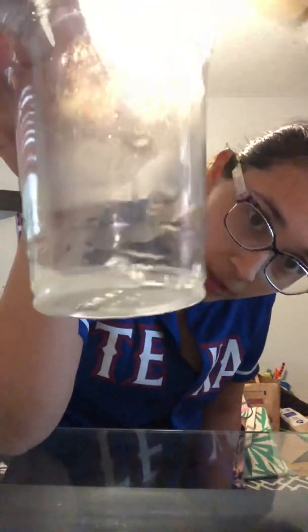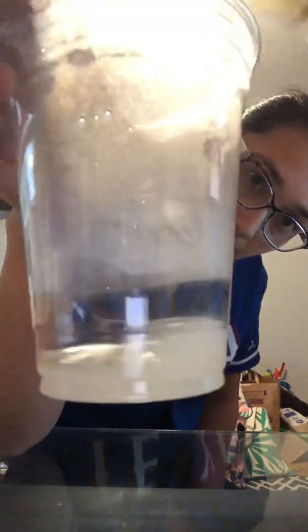There is a slight color change. It's no longer just clear water. It's a little bit cloudy, gray colored. It is really hot. Not quite a smell to it. It kind of just smells like the calcium chloride. So in that second box, you're going to say color change, heat, dissolving crystals. So there you go.